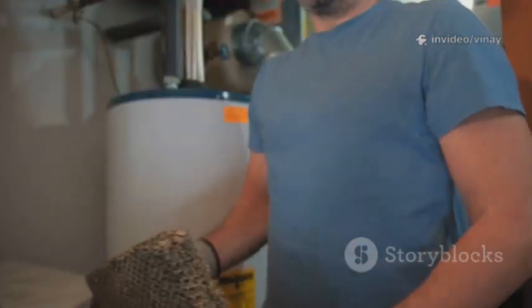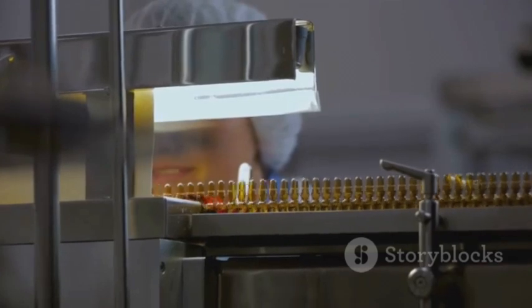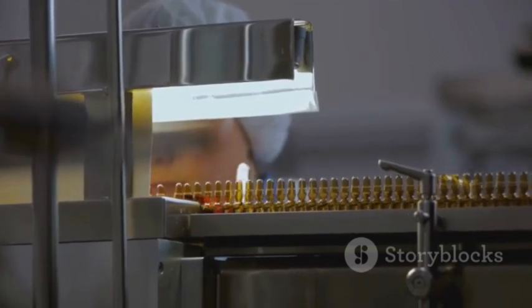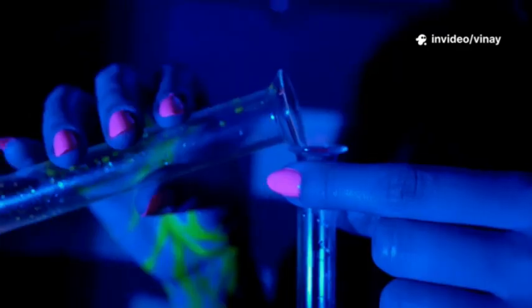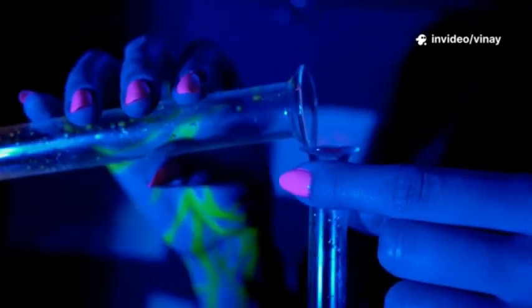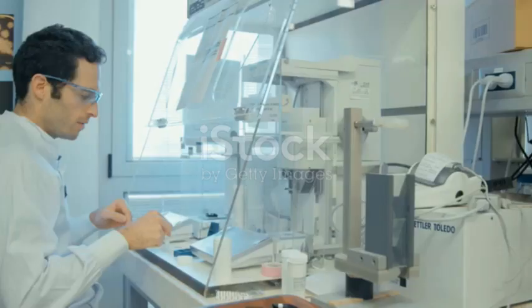So, a filter that fails the bubble point test must be discarded. The entire batch of medicine that was filtered with it might have to be thrown out as well, because we can no longer guarantee it is sterile. This simple test, based on the physics of bubbles, is a powerful tool for ensuring medicine safety.